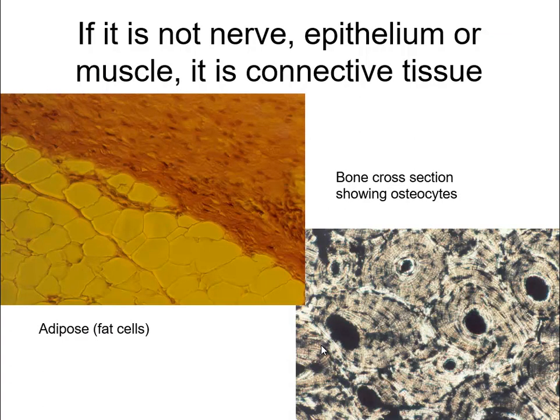Any tissue that's not nerve, not epithelium, and not muscle belongs to the connective tissue group. This is going to include blood, bones, and fat. We've talked about fat cells — they look empty; the yellow ones on the left side of your screen are adipose or fat cells. We haven't gotten to bone yet, but bone also belongs to connective tissue, and it looks like tree rings made out of calcium and phosphate.